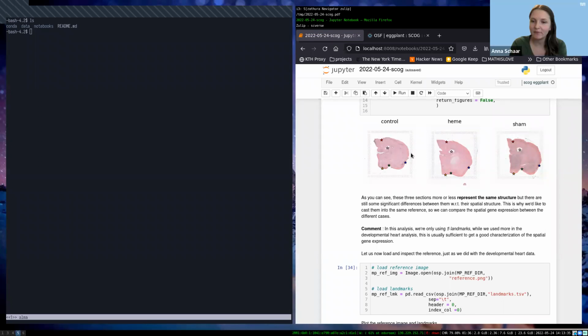Yes. And we have one comment in the chat, and I think it would be nice to get your idea on this. The comment was, maybe it would be a good idea or feature to visualize the displacement field between input and output to make sure no pixels move to a crazy location to match the CCF. Yeah, that's really good.